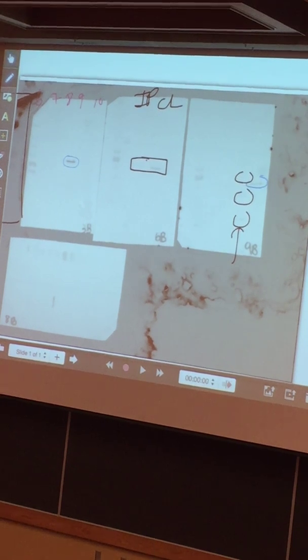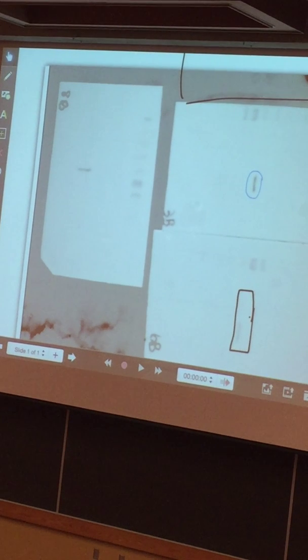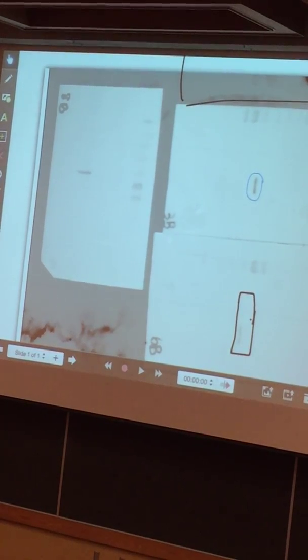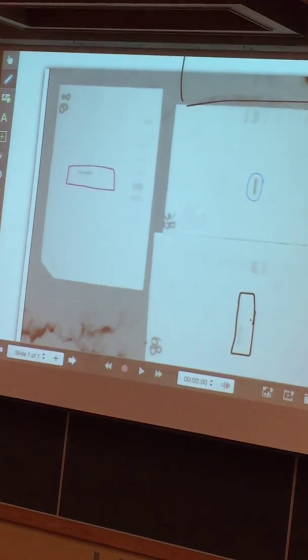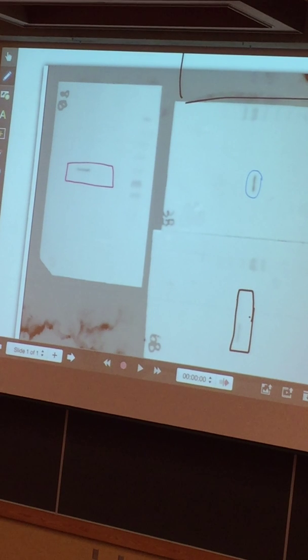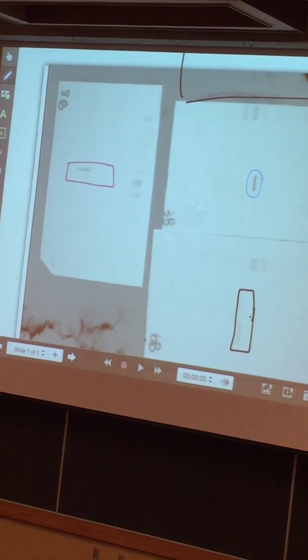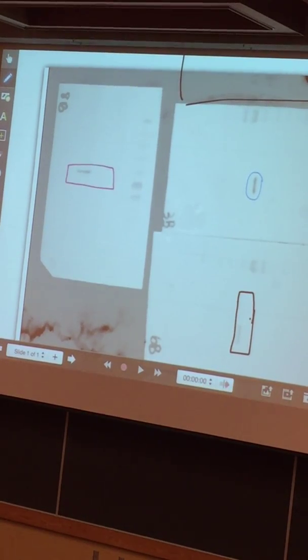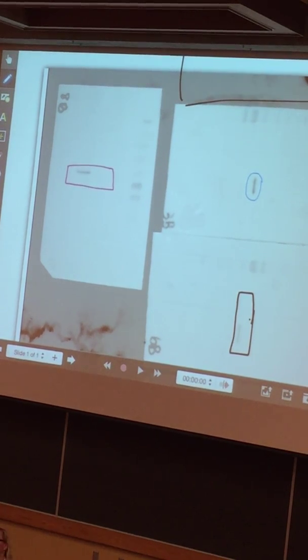You will see the secondaries coming up as well. All right, and then we have our other lane there, the same idea here. Difficult to say if we see anything in this region here, kind of, sort of, but I'm talking about the second lane there. But definitely a nice signal, probably for the cell lysate, maybe for the IP, depending on how you loaded it. So if you did get a good result, as in you had either two bands lighting up or just one band lighting up, lots of things to discuss and reflect on.